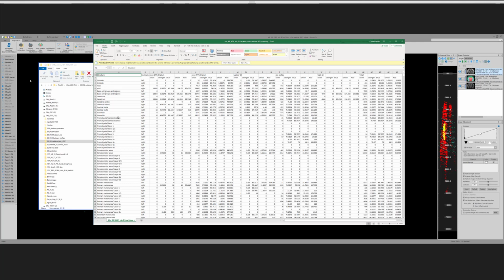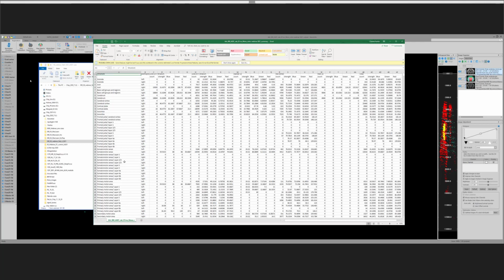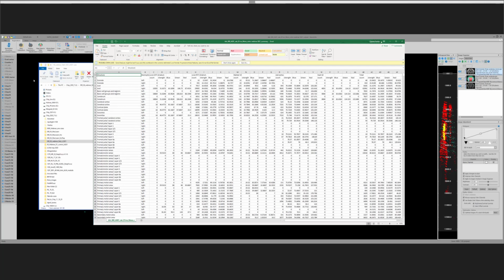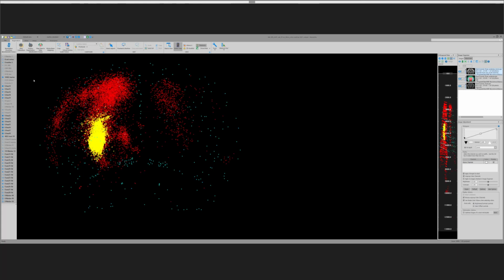It also generates a file that contains the number of markers in each of the 2,500 structures in the Allen space. So in the frontal pole, and this is hierarchical as Brian has described. So this contains all of the data, and I'll get back to that later. Anyway, those are the other files that are generated.